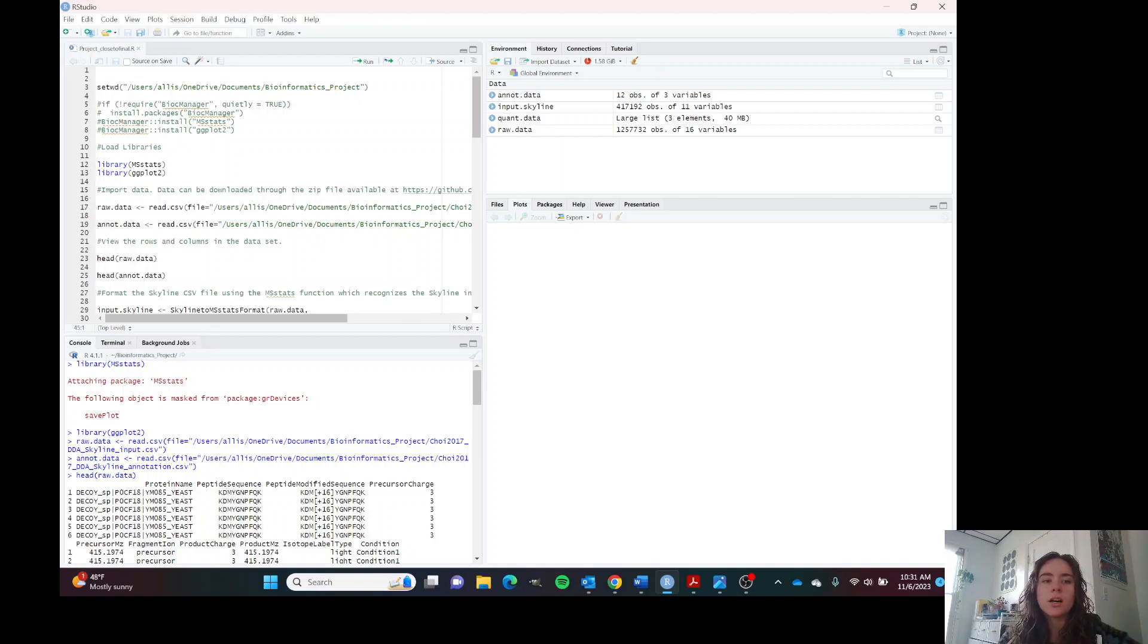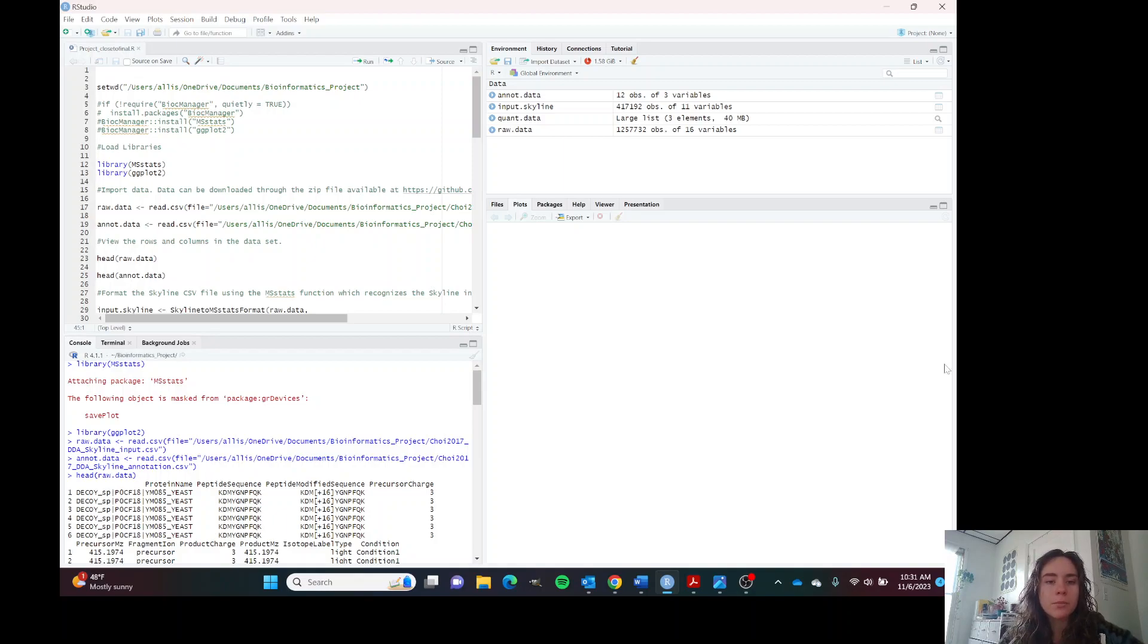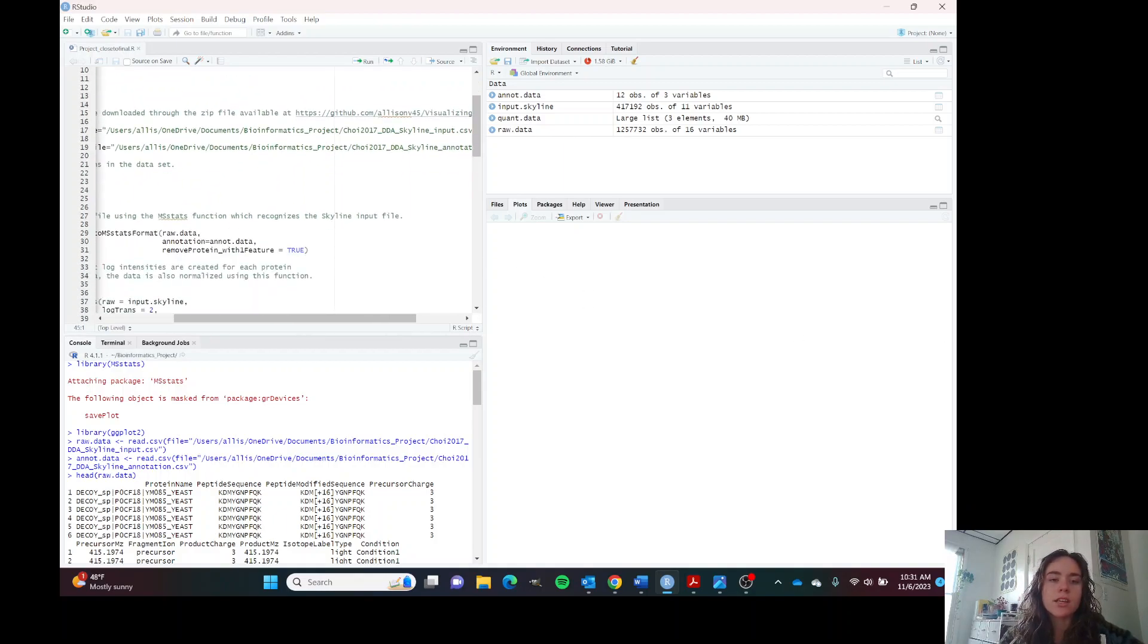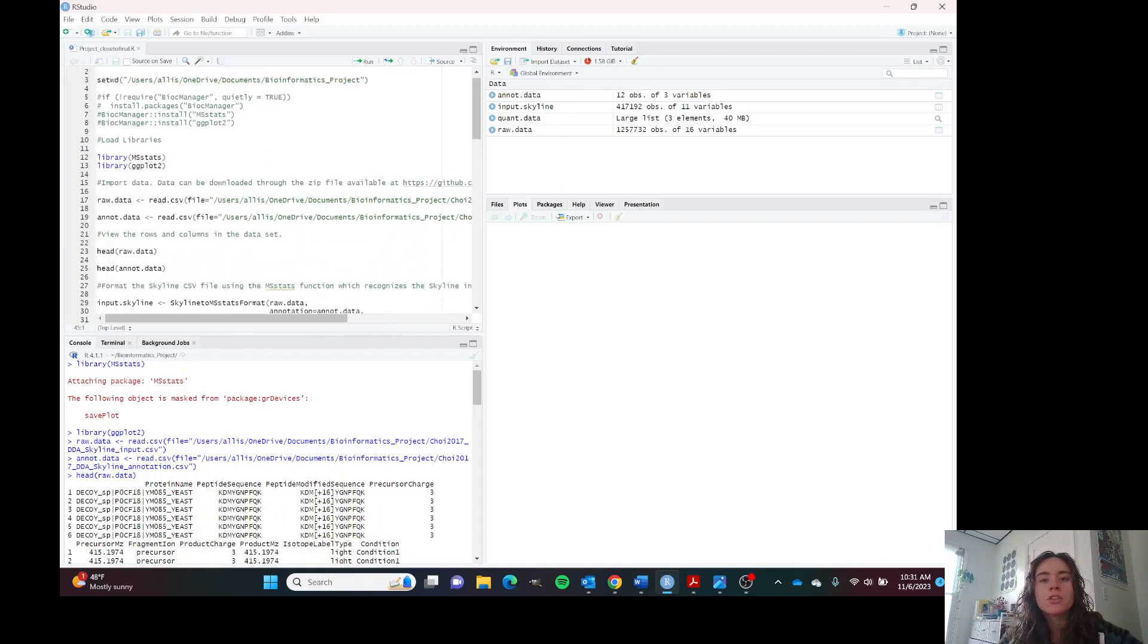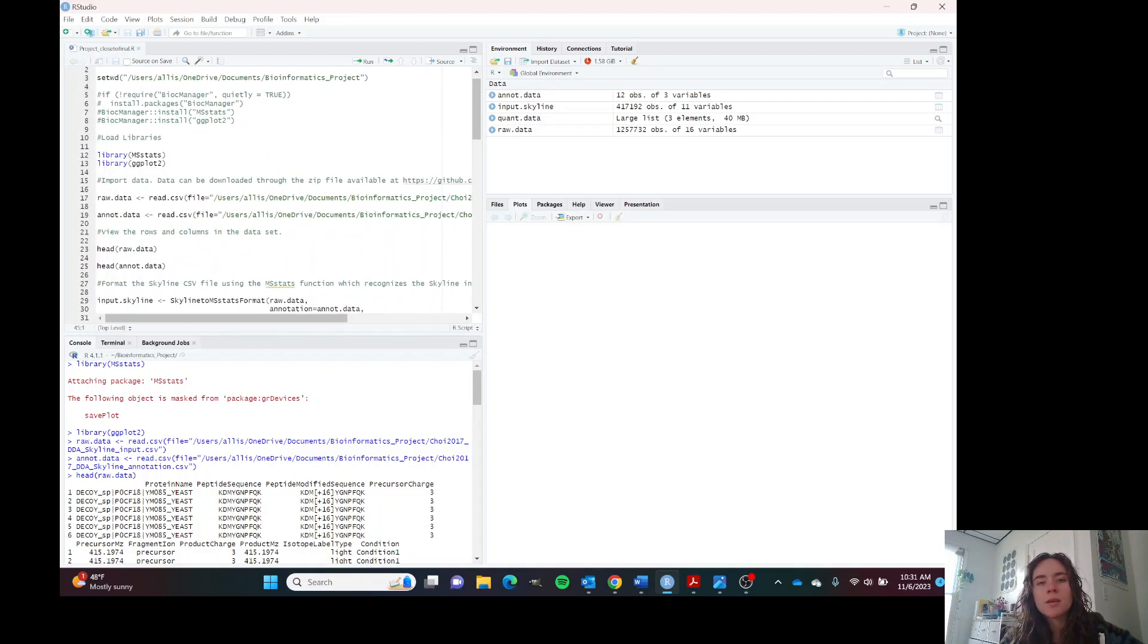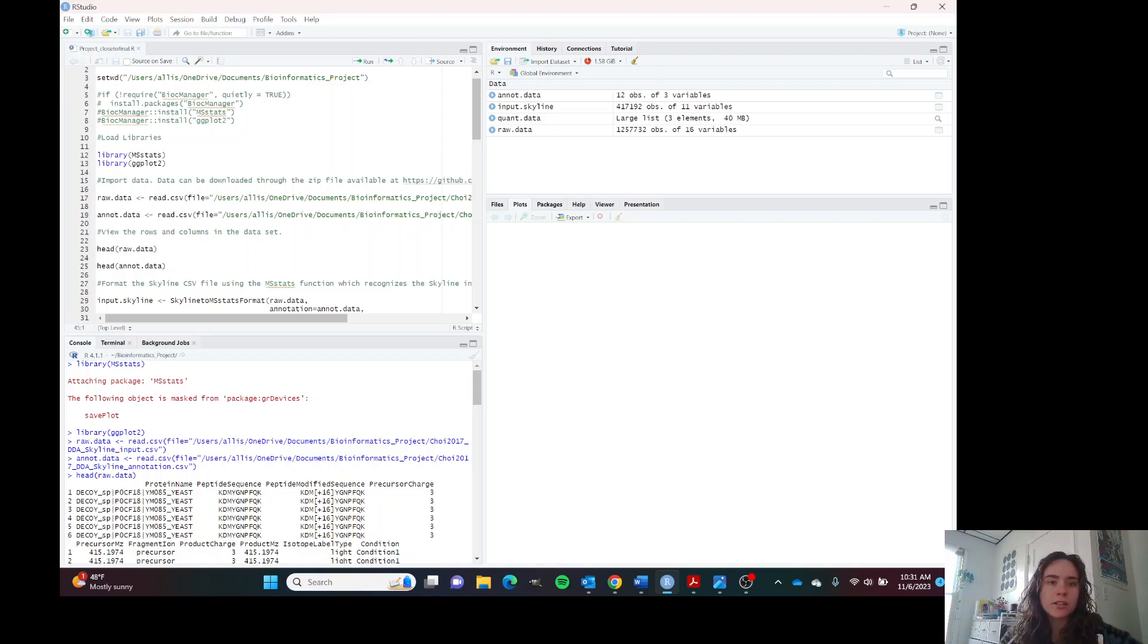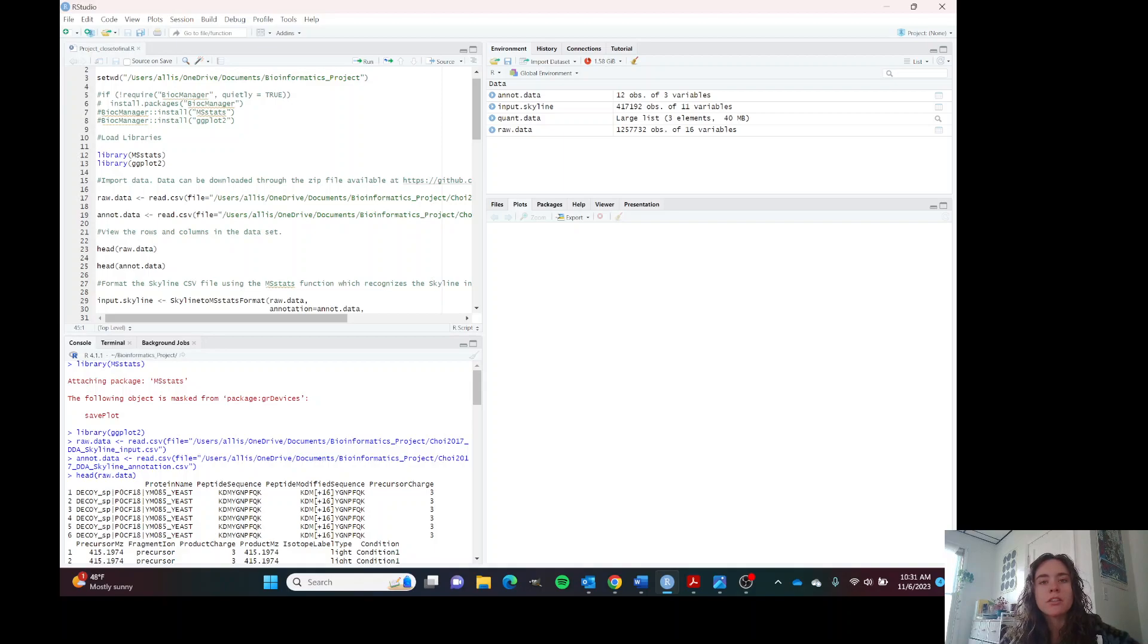In this case, the program Skyline, which creates the output file which we are using in this tutorial, uses the m over z charge value to assign each ion a peptide sequence. And that's how we measure the presence of the protein.